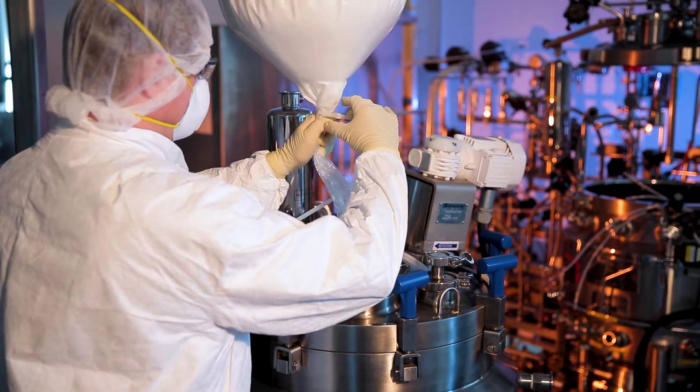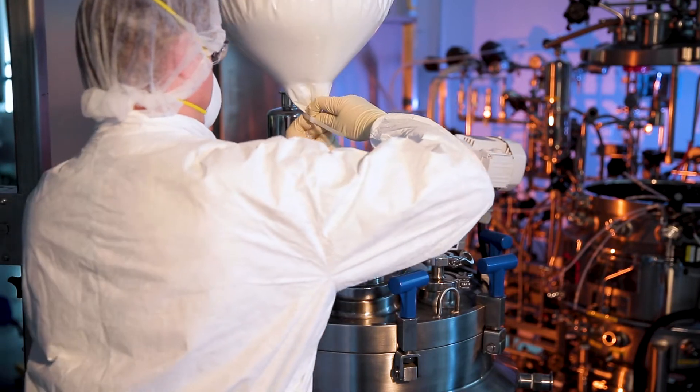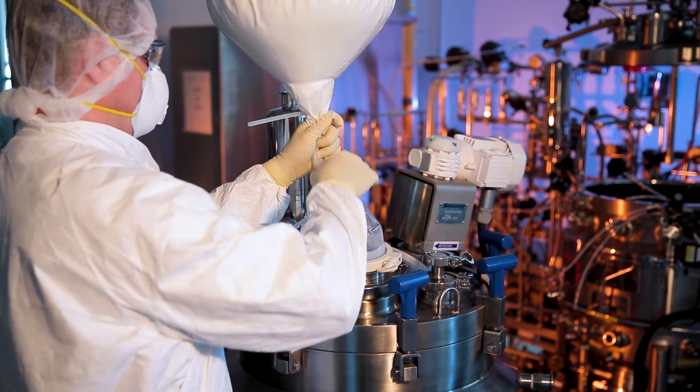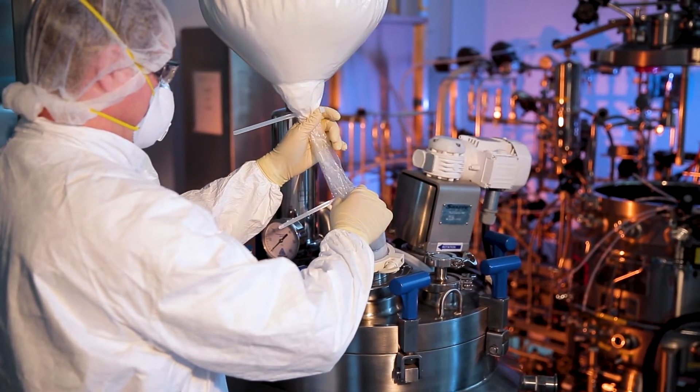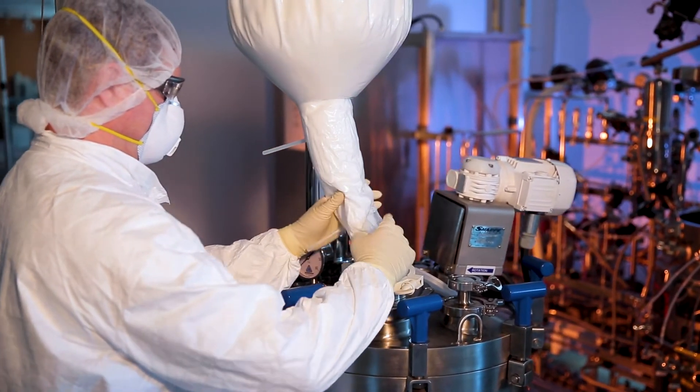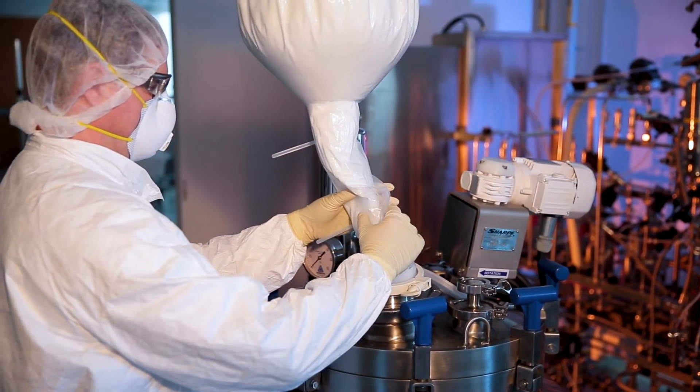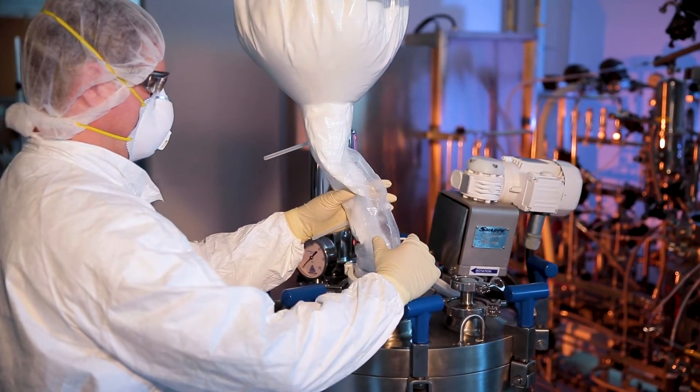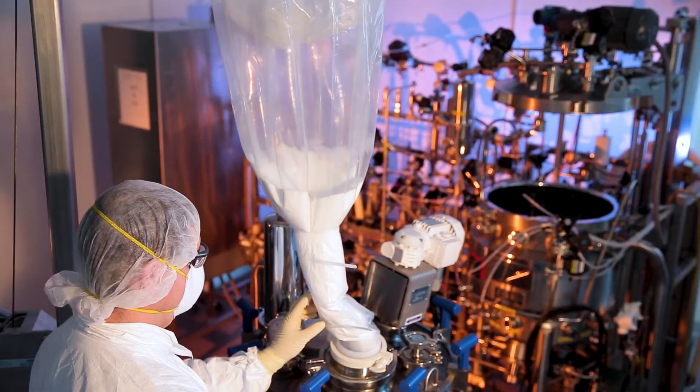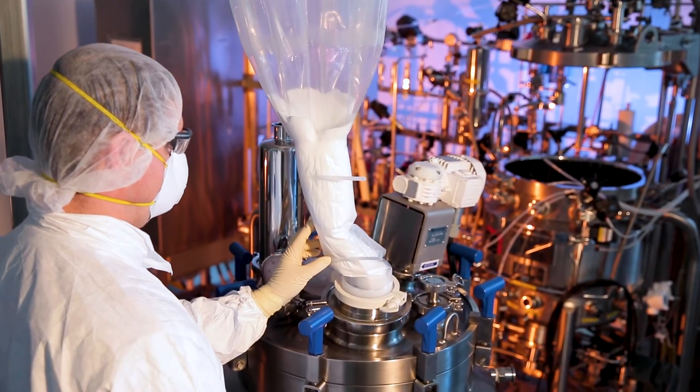Our bags are also made using our ArmorFlex 114 polymer with inherent anti-static properties. The combination of the EZ-Biopac bag's geometry and its anti-static material work together to minimize product retention. In fact, live testing showed product retention of only 2 grams in each of three separate trials when discharging 5 kilograms of powder. That's a retention of just 4 hundredths of 1%.